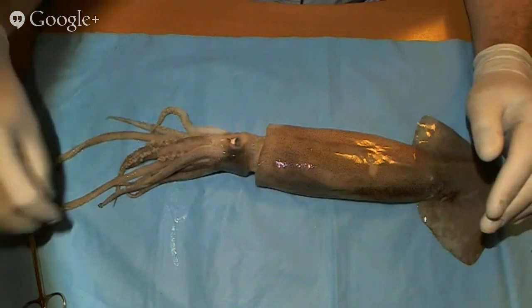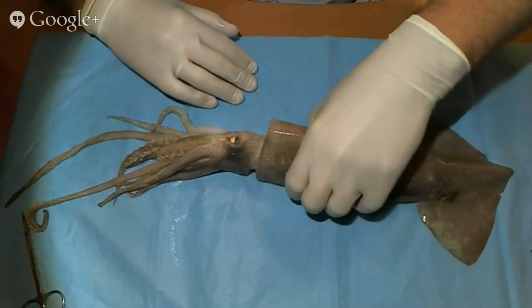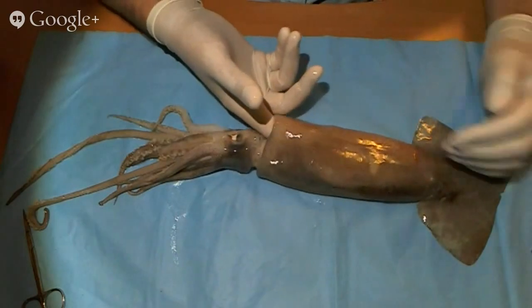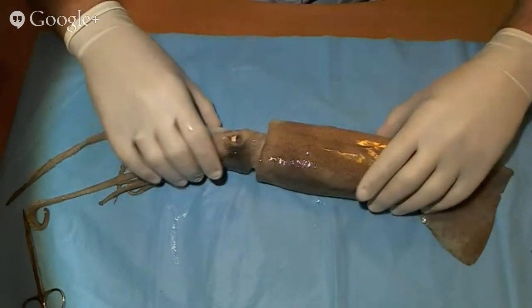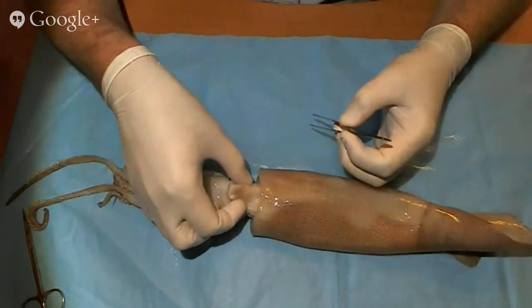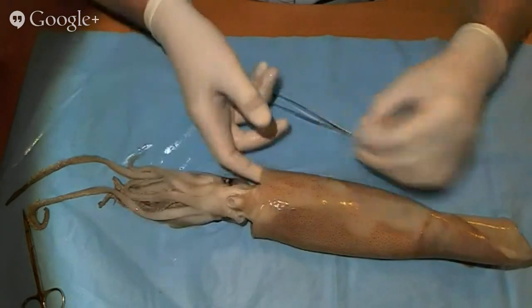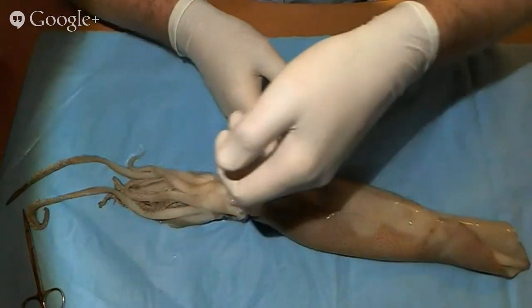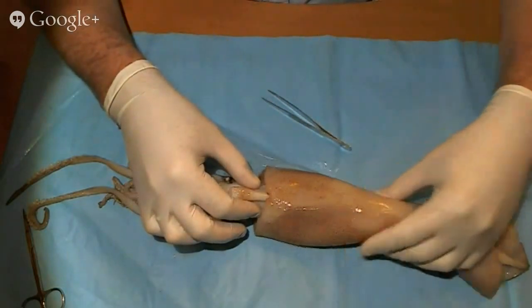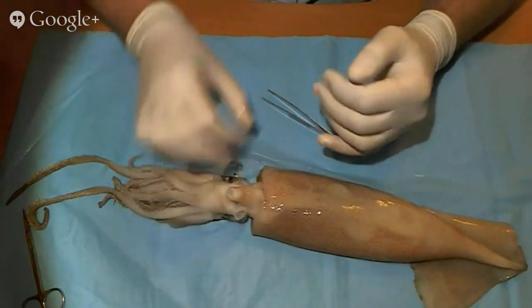But in the end, we'd have to tell them, most likely, unless they've seen some other information on it, that squid suck up water into this giant thing here that's called their mantle. So they suck up all the water in here, and then you ask them to see, can they see this little thing in the back that is called a siphon? It's a little tiny tube here, and what they'll do is suck up the water inside of here, and that water then will shoot out. They'll squish it out with this giant mantle muscle, and they direct it through this siphon like a little jet.